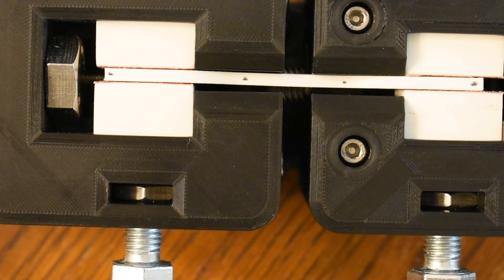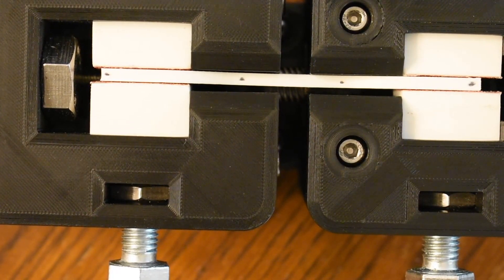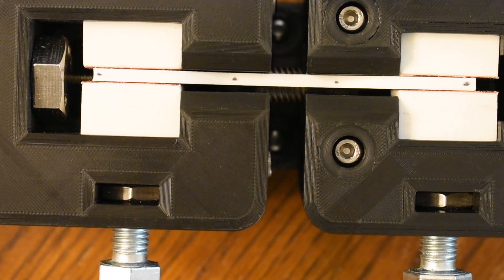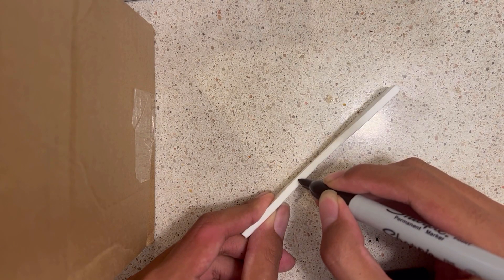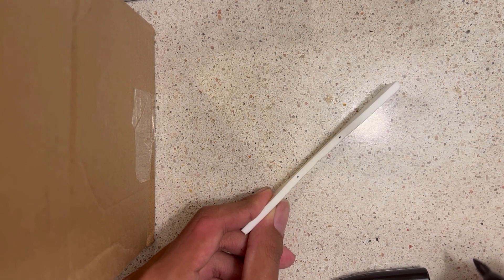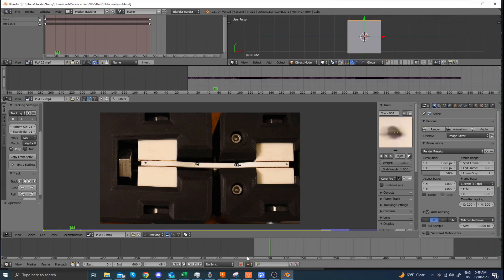Now to measure strain. We mount a camera a certain distance above the specimen and track its elongation using moving dots marked by a marker. This is known as an optical extensometer. Using the camera recording and Blender code made by CNC Kitchen, we can extract the elongation values from the specimen, which gives our strain.